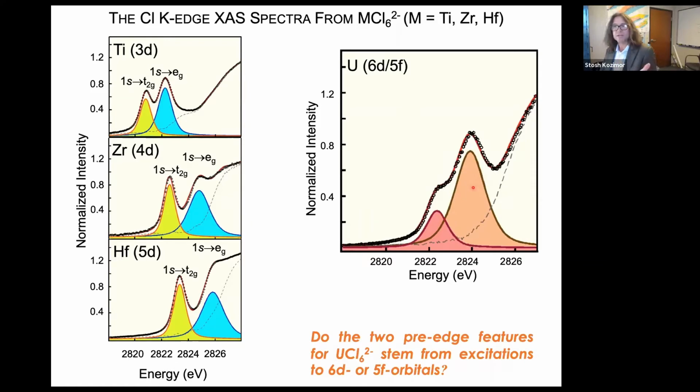We walked back from the synchrotron and we said, look, here's T2G, here's EG. We think there's no F contribution to bonding. And our theory collaborators, Ping Yang and Enrique Batista, ran some calculations and they said no, they did not think that was the correct interpretation.